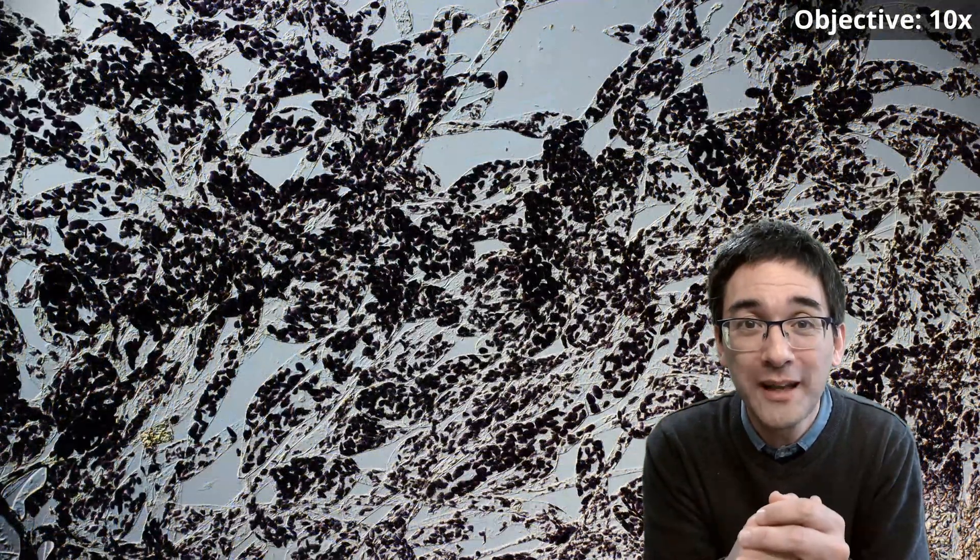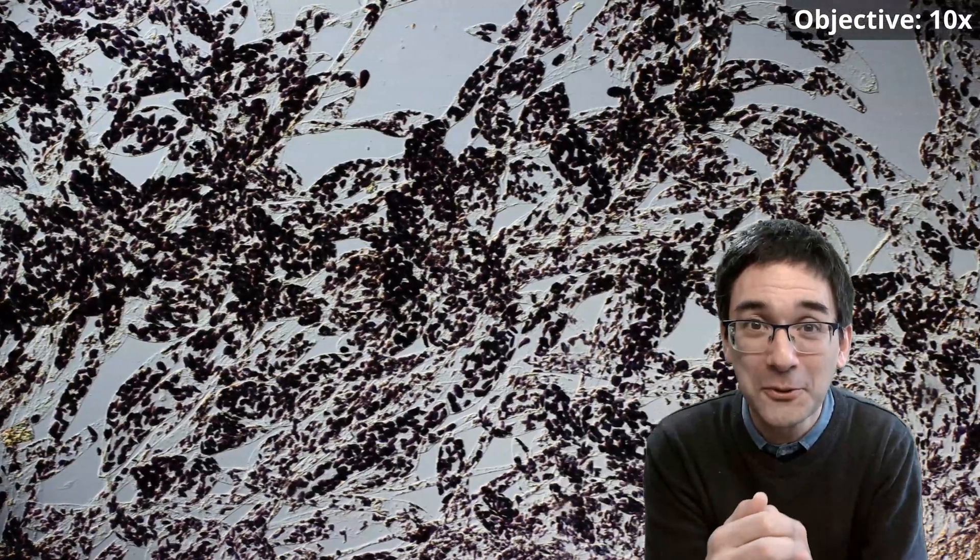And the result is much better now. All of those dots that you see now are the individual starch granules. So you see there are lots of them here, and this basically explains why bananas give us so much energy, because they're loaded with starch, just like potatoes.